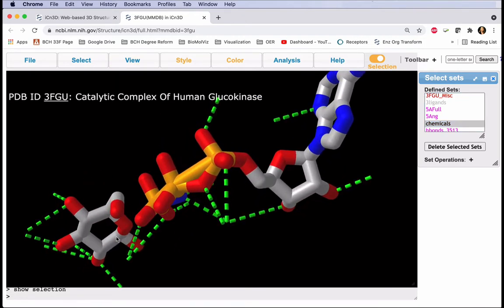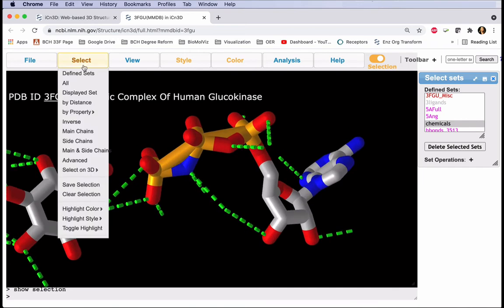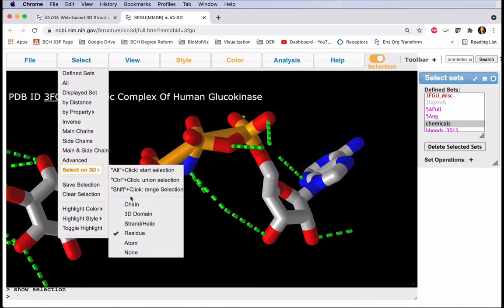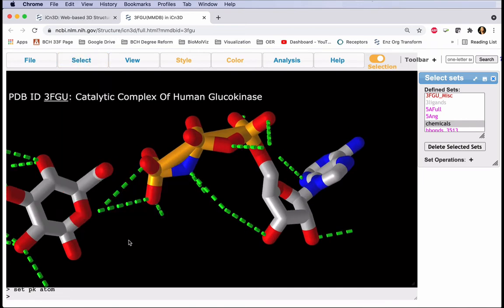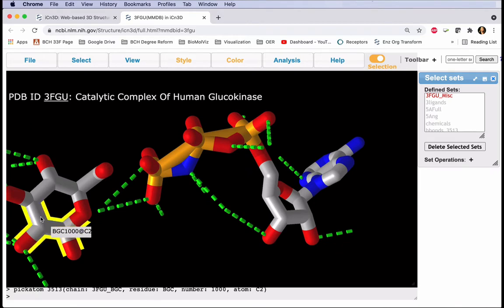Now we can select each carbon atom in this structure. Select, Select on 3D, and this time select Atom. Using our same method, Option click on the first Atom now, and then Control and Click to Add. Click on each atom.